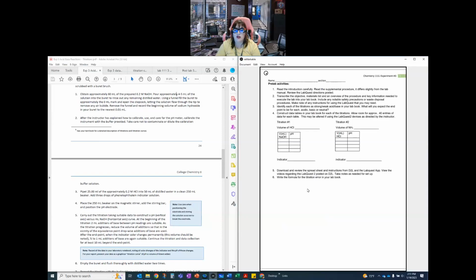So you will need to calculate a titration error. And that formula should be in your lab notebook. Your titration error is going to be the absolute value of your actual minus your theoretical, over the theoretical, and that's times 100.